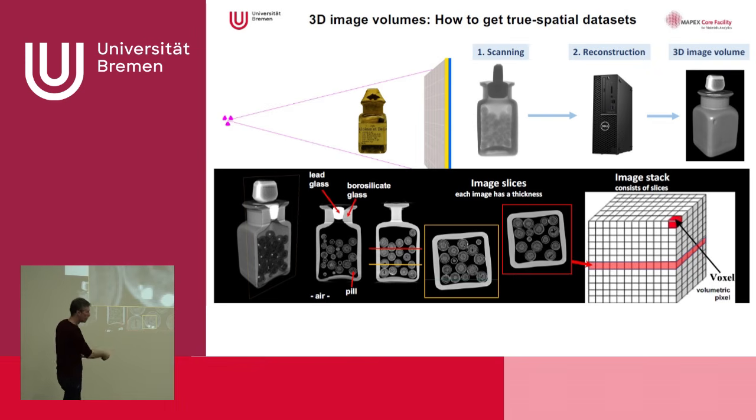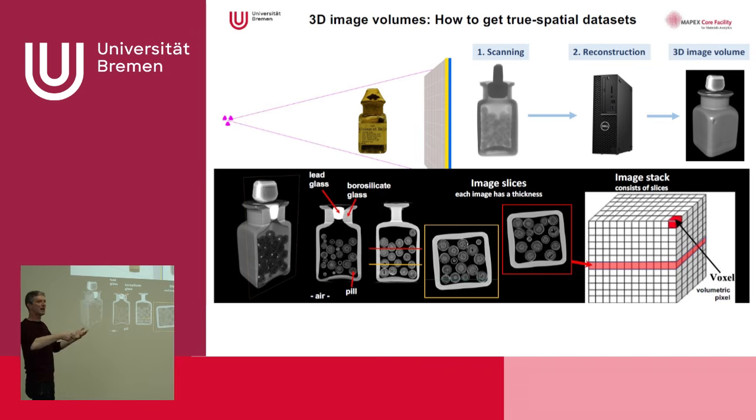And if we want to look more closely, we have to make a high resolution image to see not the whole sample, but maybe only a portion of it. And this is also what we can do.